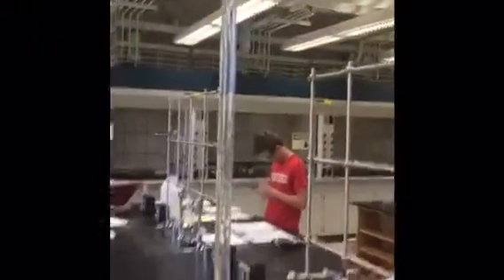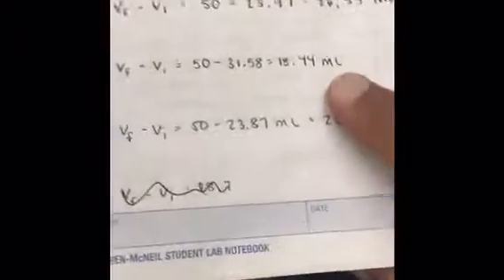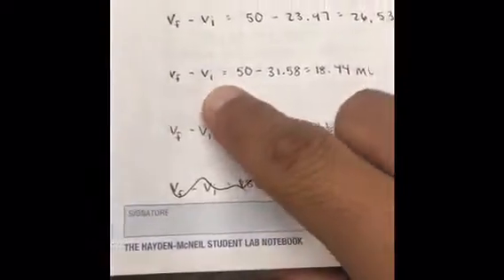The initial volume is 50 milliliters. And then you can't have bubbles. Because we saw a light pink color, the final volume is 31.58 milliliters. Alright, the volume delivered is 18.44 milliliters. I found that by subtracting the initial volume by the final volume.